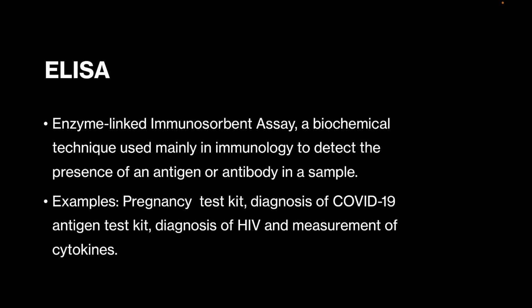So now I think the principle and how it works is clear: it detects the presence of a protein by the antibody in the test kit, or it can be vice versa as well. This is a very important technique and I will talk about the principle behind it. The basic principle, as I have told you, is that in the test kits you have antibodies already present in the kit.